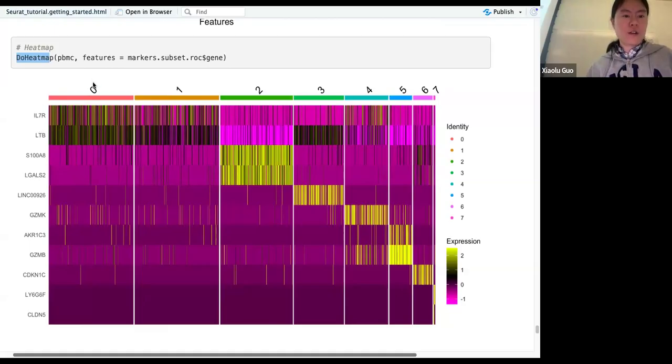These two, using the test, are marker genes for cluster 0, and we can see it's fine. And then this one is for 1, and that's terrible.